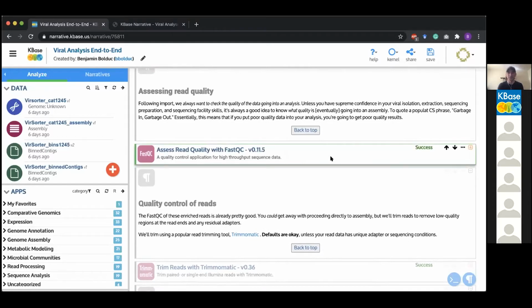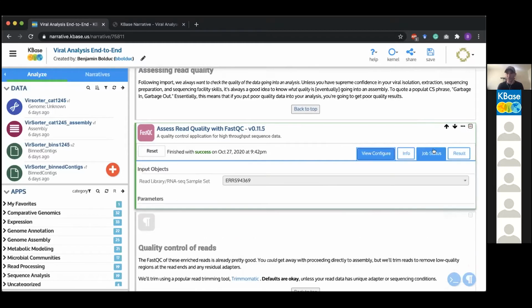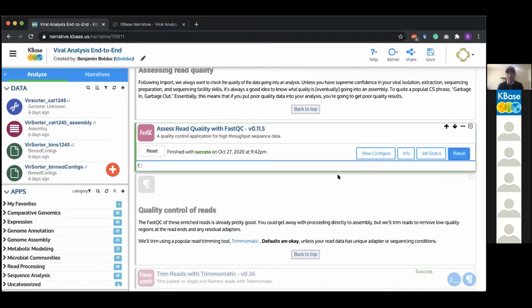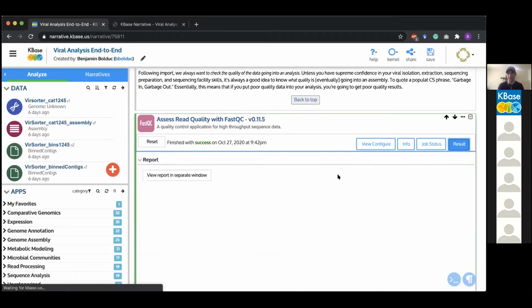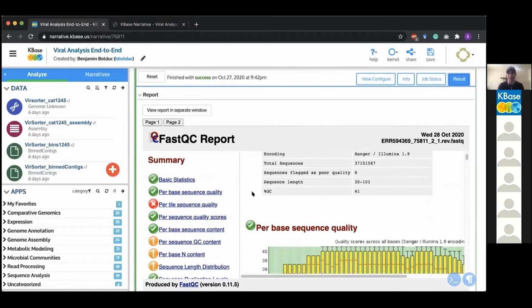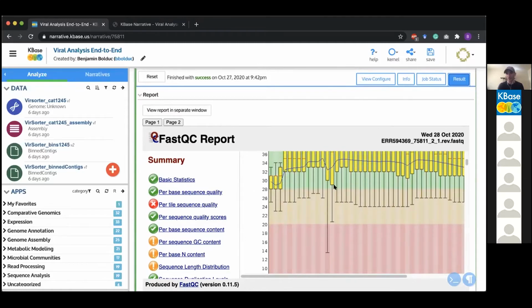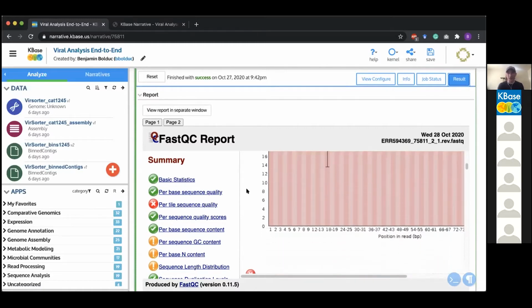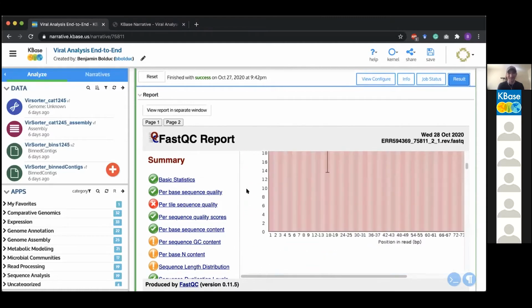So for this, we'll use FastQC. I won't go into too much detail here either. There's nothing really specific about viral sequence data that you should be aware of when using FastQC. This is actually a really good data set. We could probably trim up a little bit in the front, back, maybe tighten up this quality. So it's probably worth trimming. You could probably get away not trimming it, but don't. I guess you're recording me, so you didn't hear it from me.